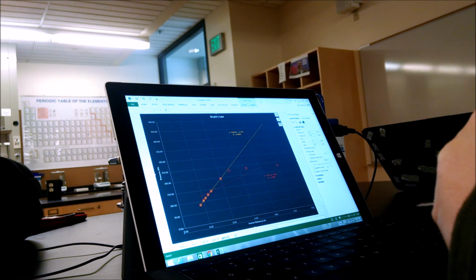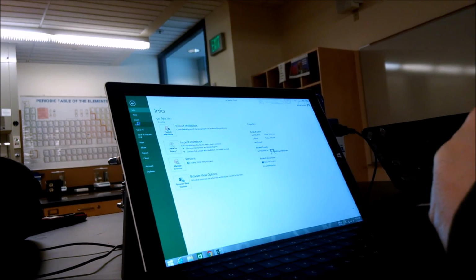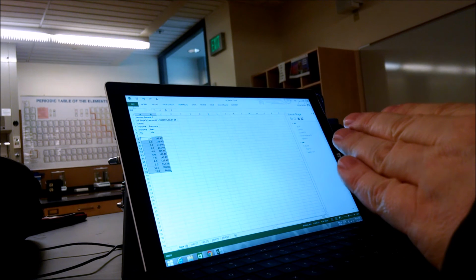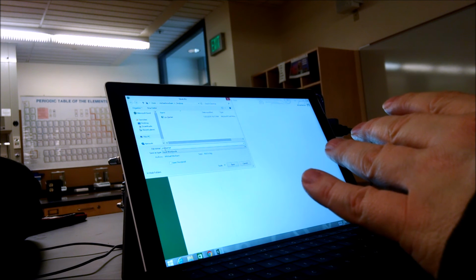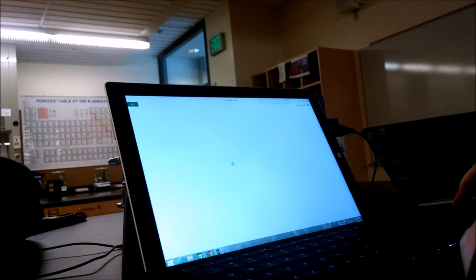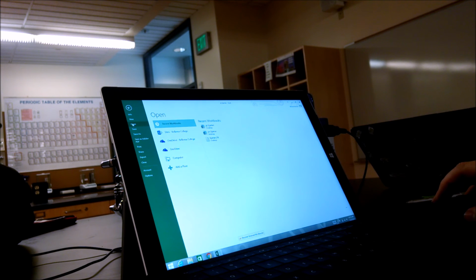Okay, and then we're just going to need to save it again. So I'm going to be back on data. I'm going to save it. So first I'm going to save it as is because it's PV and it's done. So that's the PV file done. But now also I'm going to save it as PT, underscore name. So yeah, same deal. Okay, so good. So now we've got this PT file. Now what do we do? Analysis for part 2. Open file PT_name.